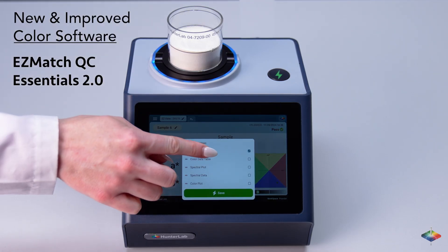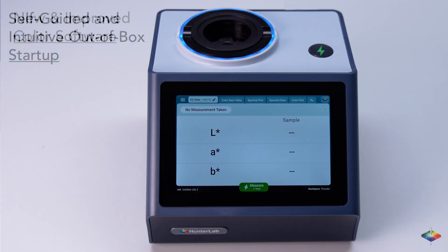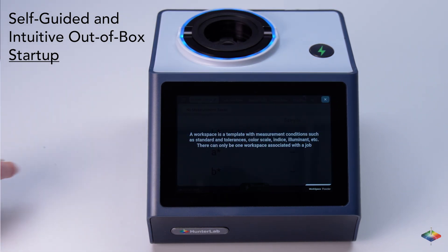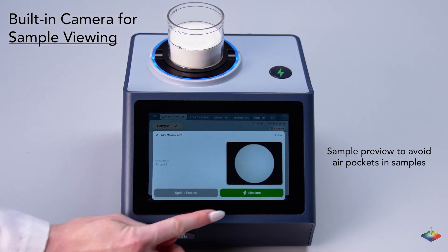Essentials 2.0 software provides enhanced reliability and user-friendliness, delivering color data swiftly. The ColorFlex L2 is ready to use straight out of the box with an integrated wizard for quick training, saving time and easing staff training concerns. Ensure accurate sample positioning and easy sharing of recordings for swift quality control decisions.